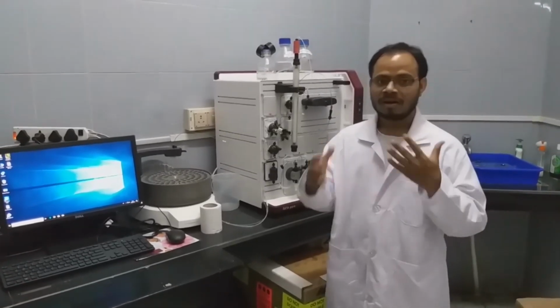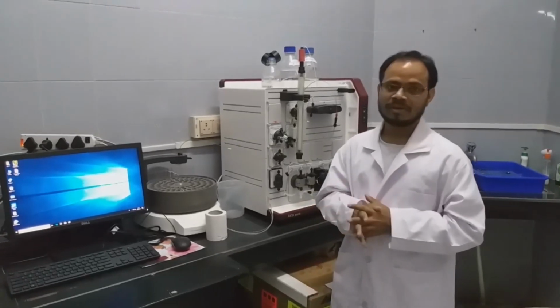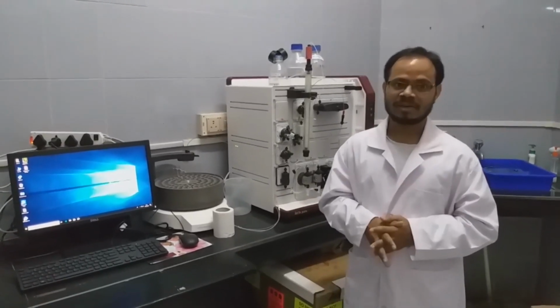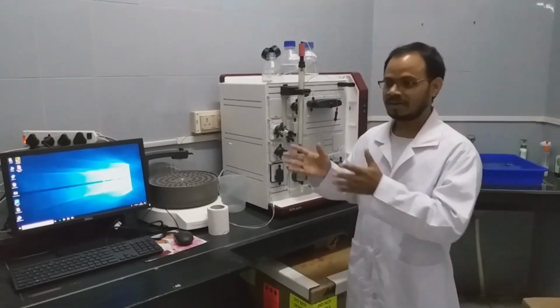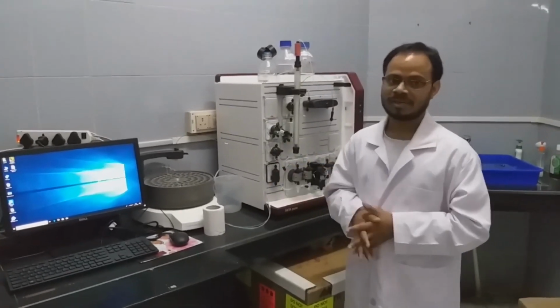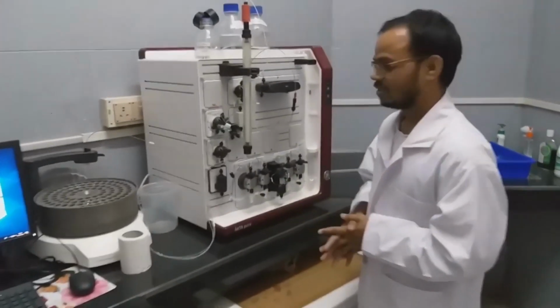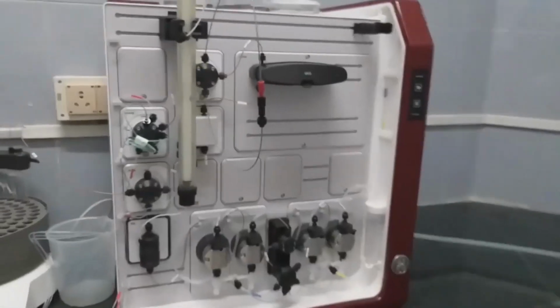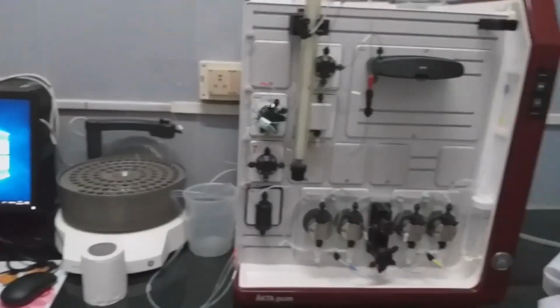So all the components we show are similar in other instruments or other companies' instruments also, but only the architecture of the instrument changes. So let's see what parts it contains. This is the instrument. It is connected to a system for observation purposes.